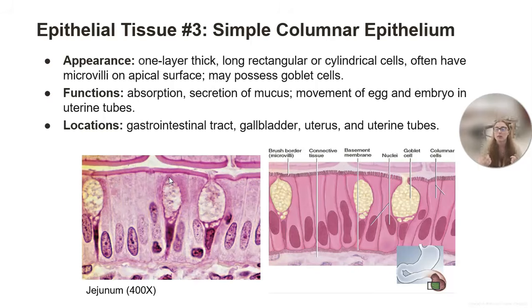Remember, we talked about this all the way in the first video. H&E stain, hematoxylin and eosin stain, is going to stain proteins pink. Now, if you think about it, our plasma membrane, our cellular membrane, is going to house a lot of proteins. Well, if we have an area of that plasma membrane that we folded over a lot of time to create all of these projections coming off of it, well, that's increasing the amount of proteins we have per square centimeter, or whatever you want to call the space there. So we end up with a really darkly stained apical surface just because we have all those microvilli there that are all going to capture that stain for the proteins that make that plasma membrane.